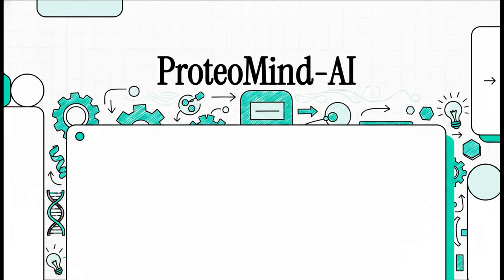Welcome to this explainer on ProteoMind AI. Today, we're diving into an anti-gravity-based multi-agent workflow originally developed for the Kaggle and Google AI Agents-Intensive Vibe Coding Capstone project. We'll be exploring exactly how this platform automates the biological interpretation of proteomics-derived gene symbols. Let's get right into it.